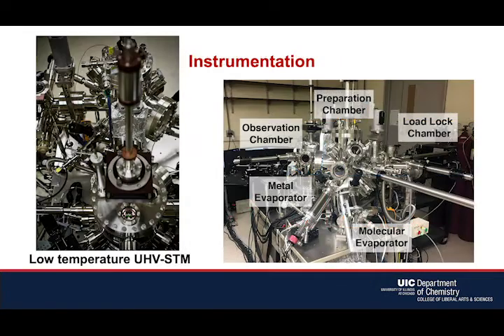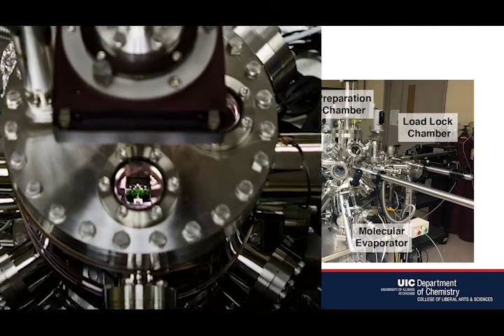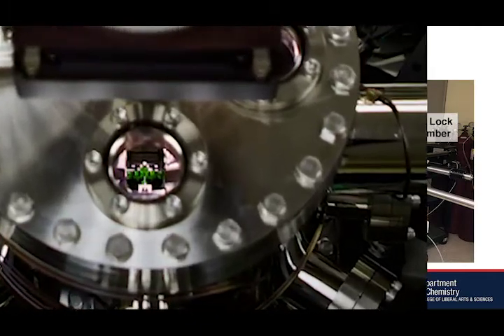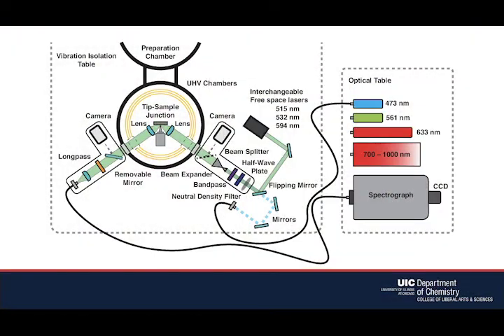blocks. My PhD studies began when I joined the Jung Group in its second year, and as such my first project was to develop optical coupling into the recently purchased UHV custom-built, variable temperature scanning probe microscope equipped with in-vacuo lenses. This schematic illustrates the home-built optical setup that allows the efficient coupling of lasers of multiple wavelengths to the tip sample junction via a combination of optical fibers and flipping mirrors. This maximizes the current and future flexibility of this system.